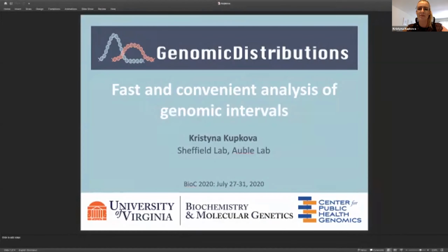Hi everyone, my name is Kristyna Kupkova and I'm going to introduce you to our new package called GenomicDistributions, which is basically this rich toolbox of functions to analyze, visualize, and to compare genomic intervals. So basically any bed file that you might have.